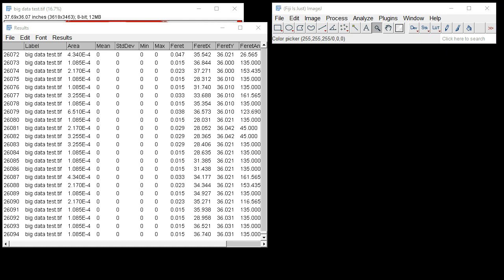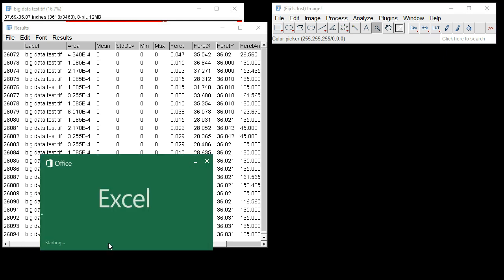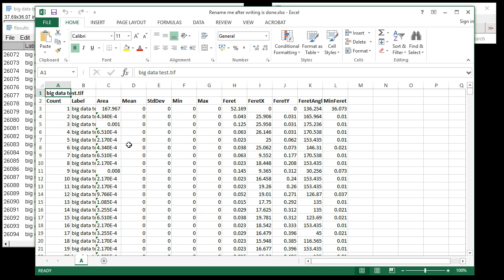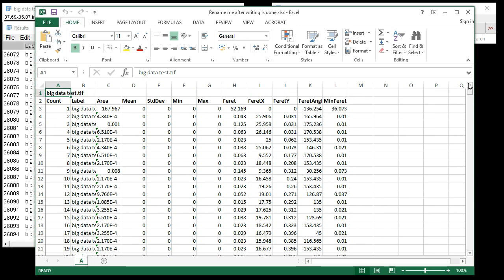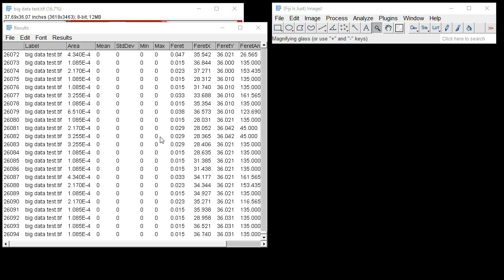There is now a progress bar showing the export. On our desktop, a file has been created called "Rename me after writing is done." By opening this, we can see the contents of the existing results table in ImageJ has been added to an Excel worksheet. By default, tab A, and the data header will be the name of the most recent open image.